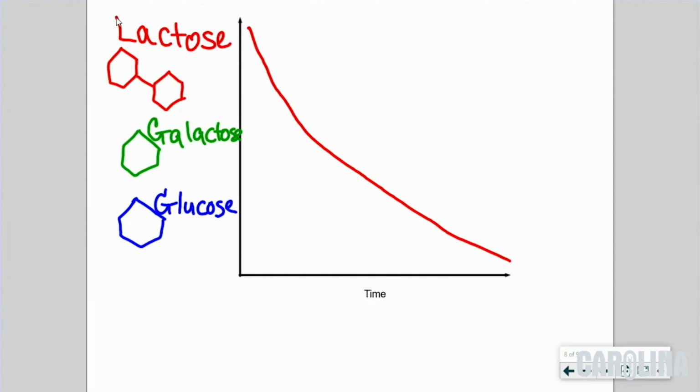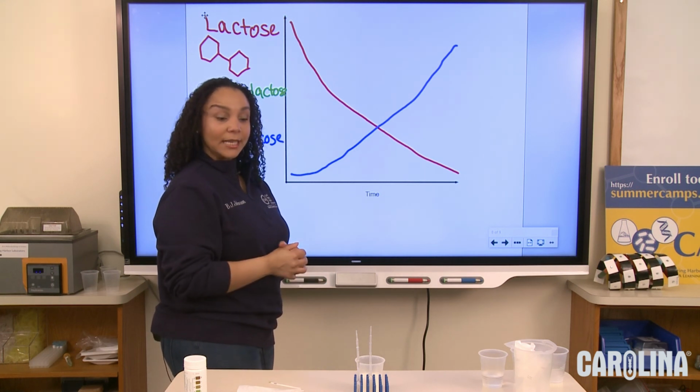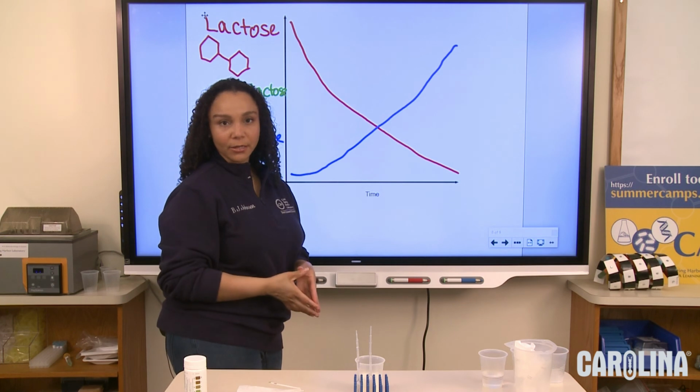if you remember what we discussed earlier, lactose breaks down into glucose and galactose. Now, was there glucose in the beginning of our experiment? No. But as time went on, we saw that the color changed in our glucose test strips, showing us that the lactase actually broke down the lactose, resulting in the products glucose and galactose. So we were successfully able to make lactose-reduced milk.